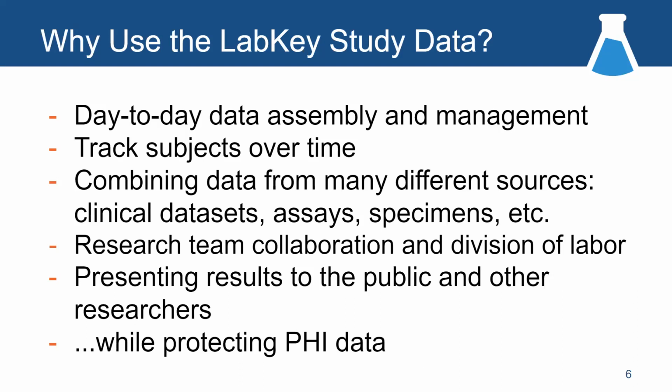Also, anytime you have lots of different kinds of data, LabKey Study is a great option. Oftentimes, research studies have data that come from all kinds of different sources. We call it heterogeneous data sources. You may have questionnaires.